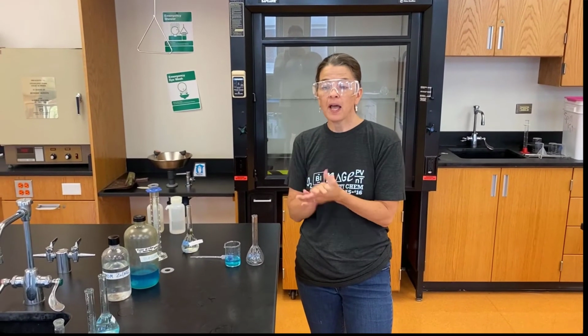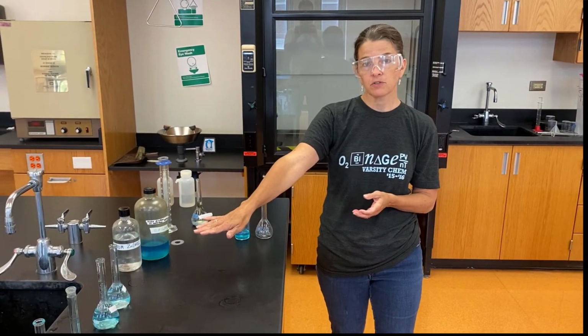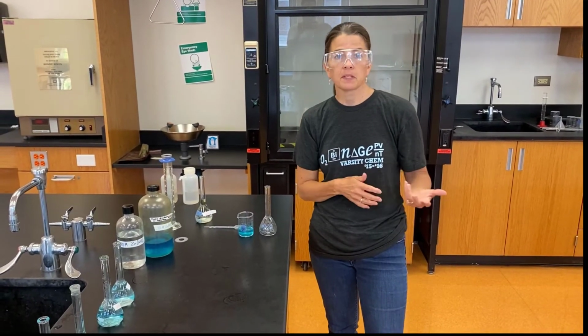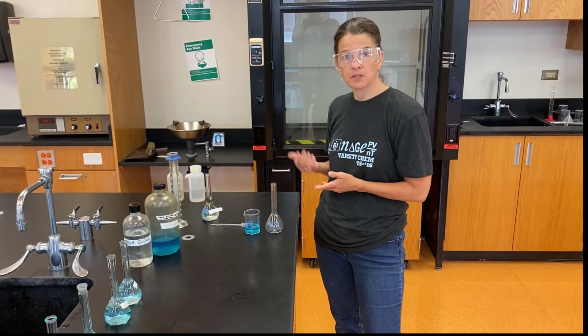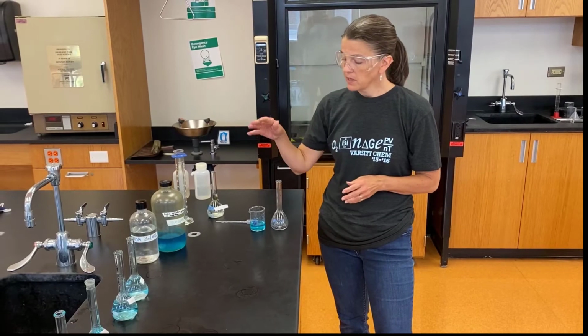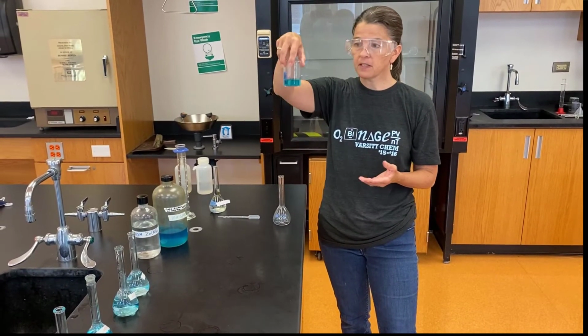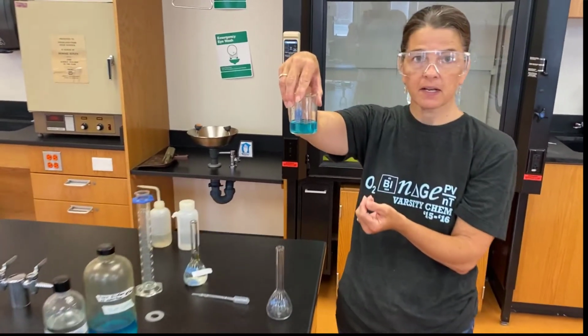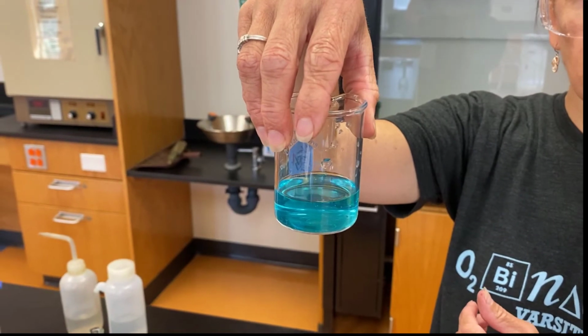Okay, so you have a graph relating the amount of copper in a solution, or its concentration, to the absorbance that it has in our SpectraViz. So now we have to back up and go back to our original samples that we did in the fume hood. So we had a penny and we had the brass pellets. This is what our brass pellets ended up looking like on day 2. So now we have to process this sample.